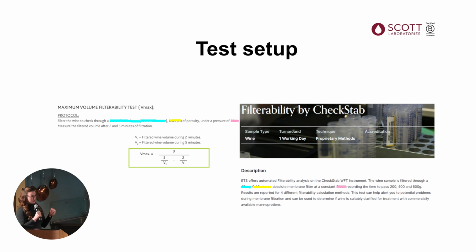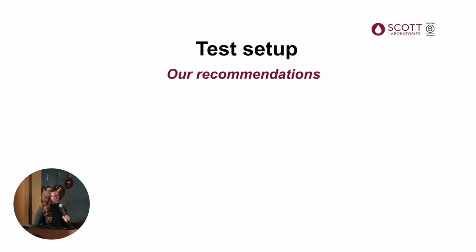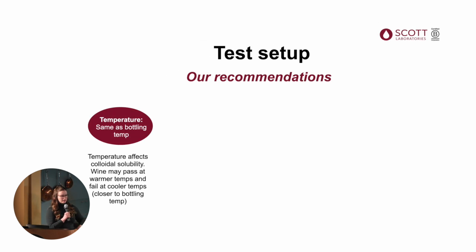Others will have you just do cellar temperature. Others will have you do the bottling temperature. So, inconsistencies in test setup. So what do we recommend? Starting off with temperature, we recommend the same temperature as bottling temperature. And this is because temperature affects the solubility of colloids.